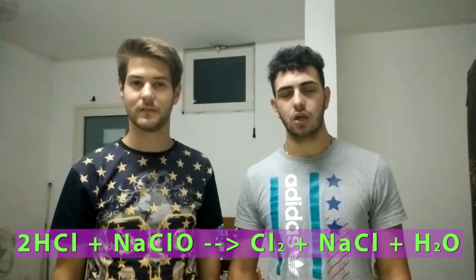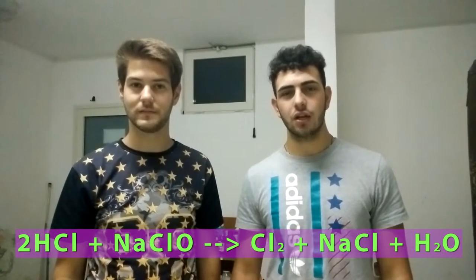Hello everyone, welcome back to Chemist by Destiny and today we will see another experiment in which we will use sodium hypochlorite, which is contained in bleach. This bleach will be added to hydrochloric acid to form a reaction in which chlorine will be produced. This chlorine will react with some metals that will be contained in coins and something else.